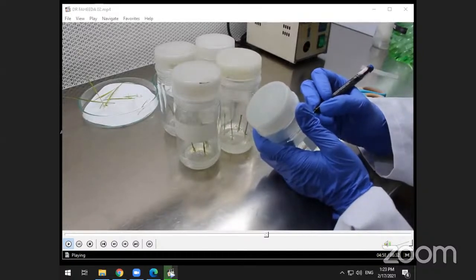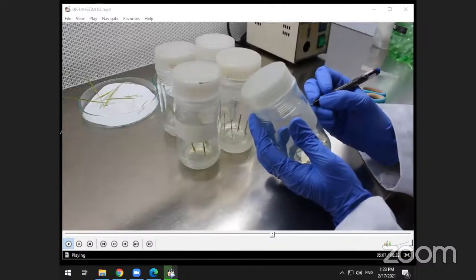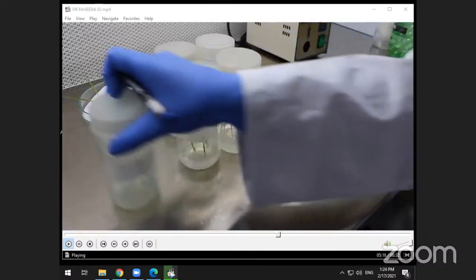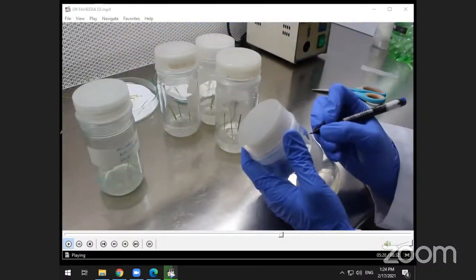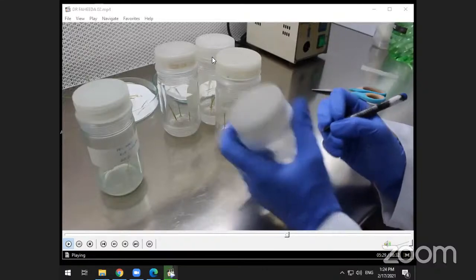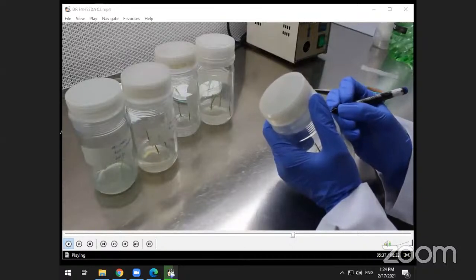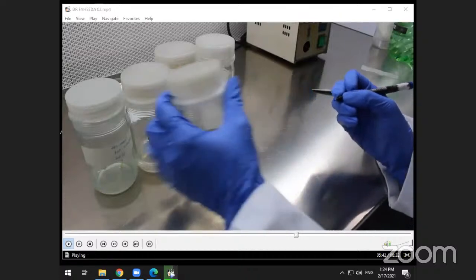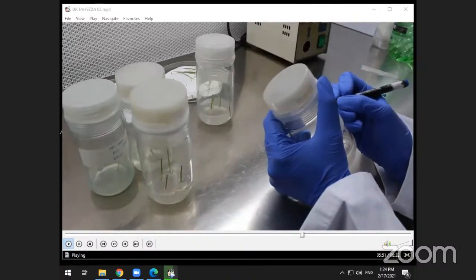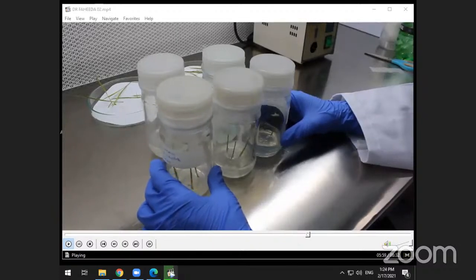Label the jars with type of plant, type of media, and date properly before shifting them into the growth room. These jars are now ready to shift into the growth room.